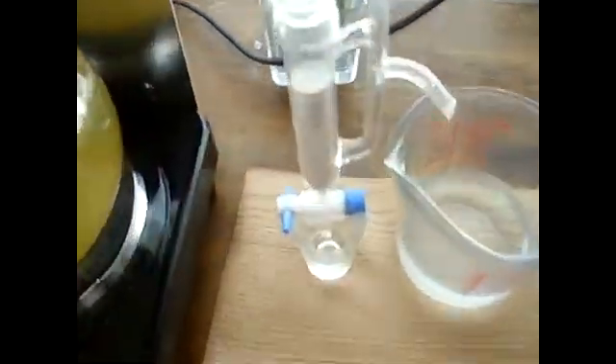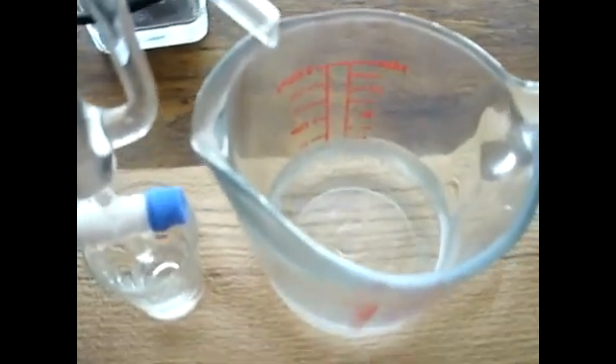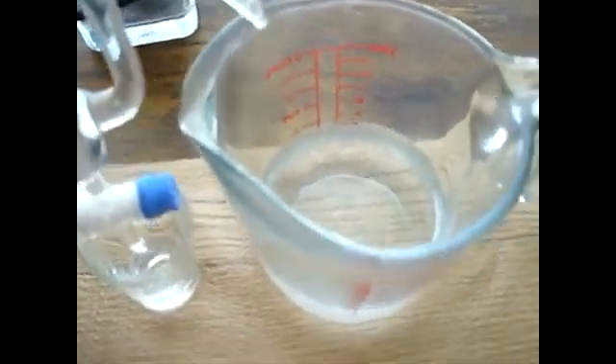From here it is condensing nicely due to the fact that I have three bottles of ice keeping this water very cool, in a pretty decent flow circulating through the condenser. Where it is reconstituting back into the separatory funnel, and the hydrosol is being collected over here.